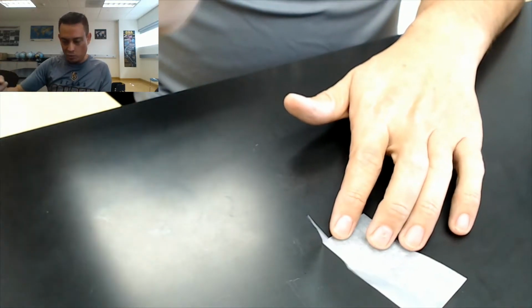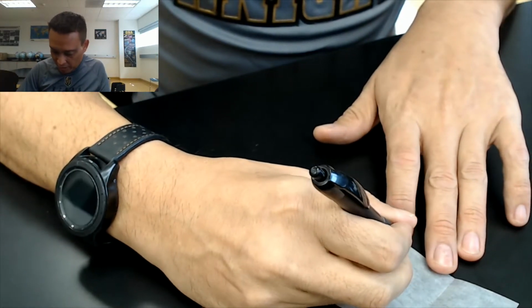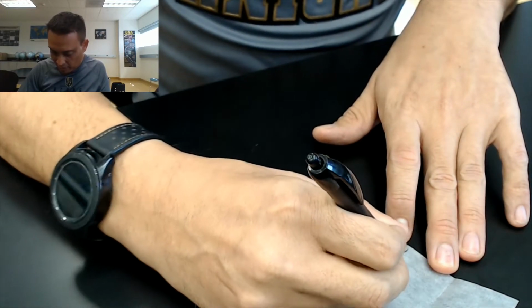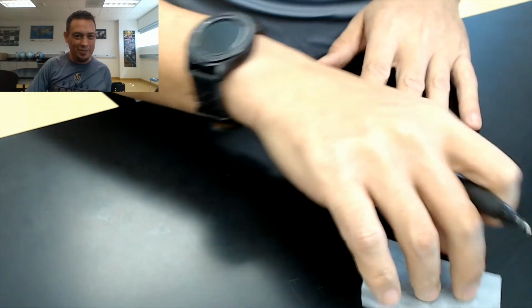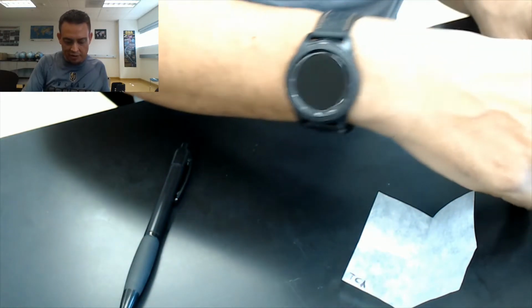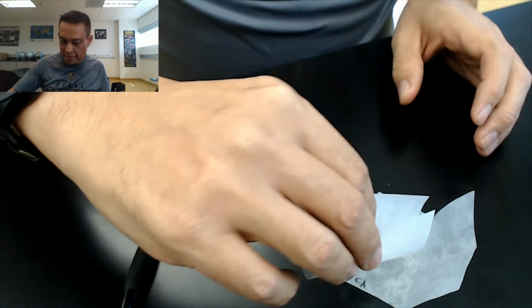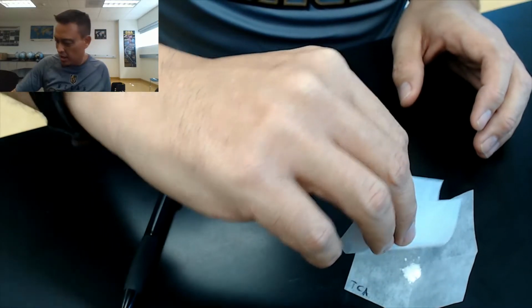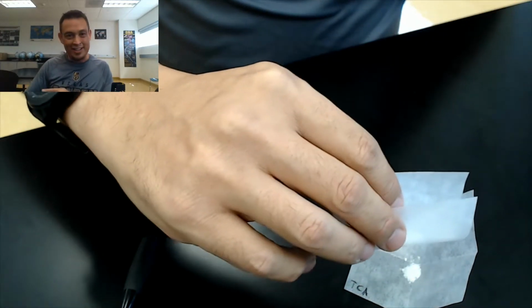And then if you're getting multiple solids like you would be in this experiment, I also recommend that you label these in the corner somewhere, because if you have like 30 different white powders on white paper, you're not going to be able to really tell the difference between them. So for this particular experiment, how much you actually have on here doesn't really matter all that much. All that really does matter is that you actually get it inside the tube.